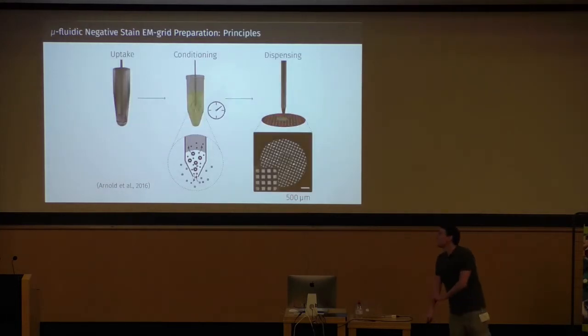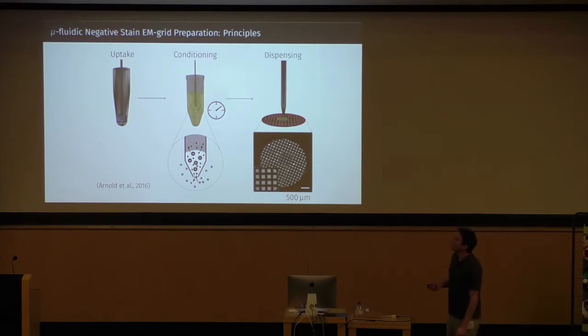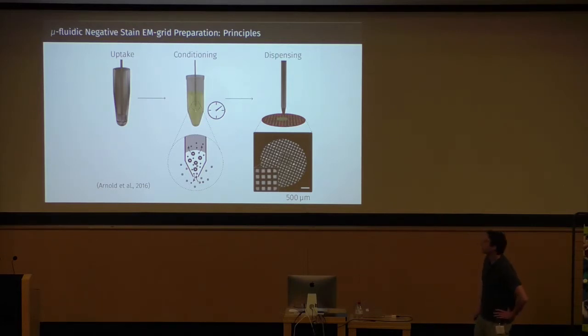The negative stain in more detail works as follows. The first step is sample uptake, where you withdraw several nanoliters of your sample. This is followed by a conditioning step where the sample is stained and desalted at the same time, and then it's deposited on a cooled grid and dried very slowly.